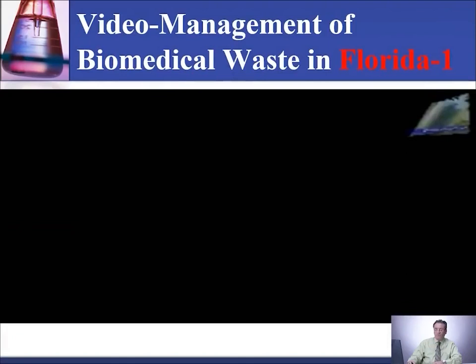I have a video for you here on the management of biomedical waste, and it's from the state of Florida. The state of Florida in America is one of the most regulated states about biomedical waste. The reason for that is that in the 80s they found lots of syringes and needles on the beaches, as I will mention in the story later on in one of the lessons on safety.